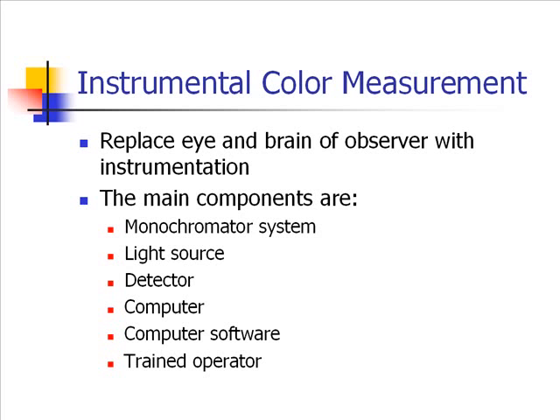One of the complaints, or at least concerns, of people in the color business is that many of their customers are buying spectrophotometers because, hey, we can buy these fancy instruments that can give us numbers about the colors, not subjective, and it can tell us our colors are good or not. They don't train their people to use them quite correctly, and then you get very incorrect results. You've seen something like that before?